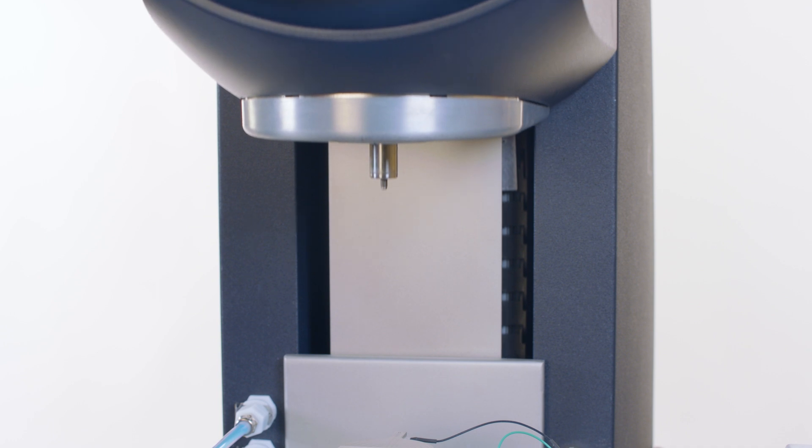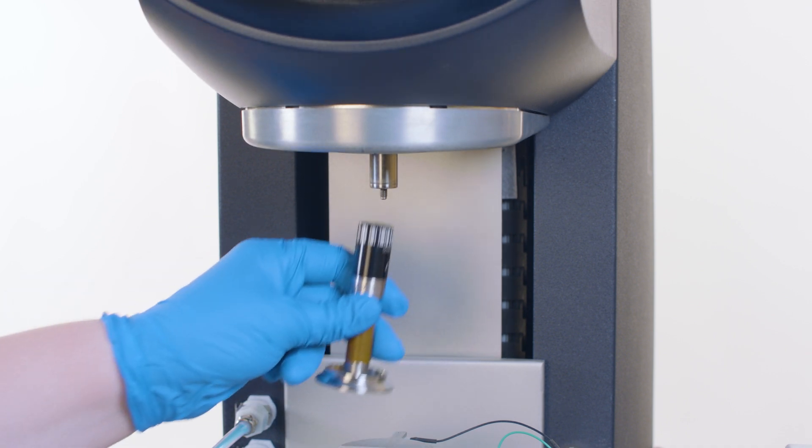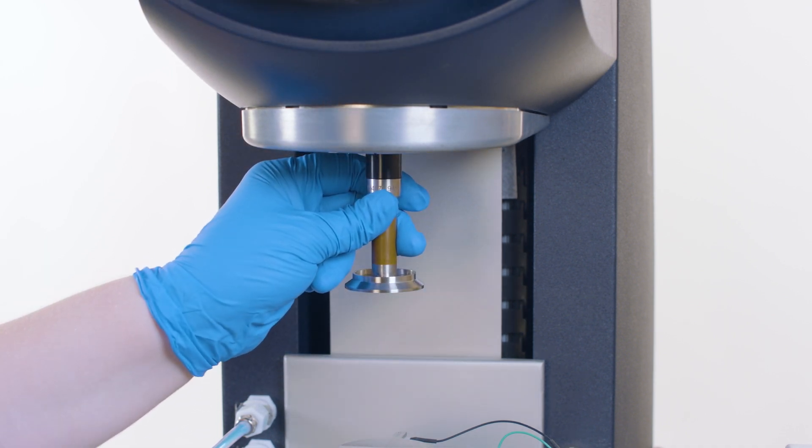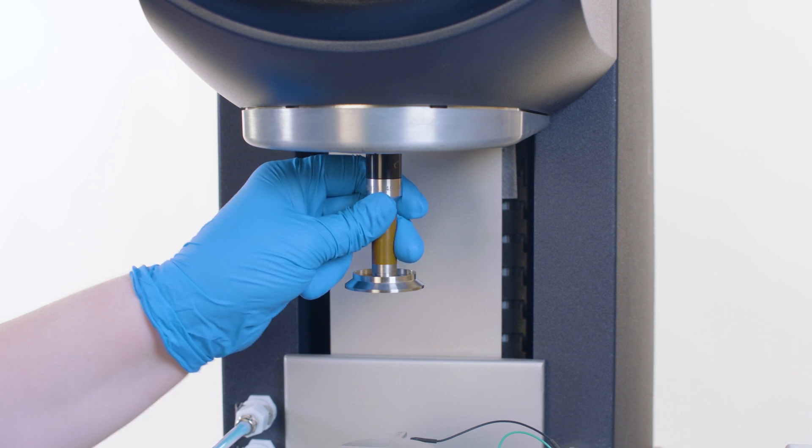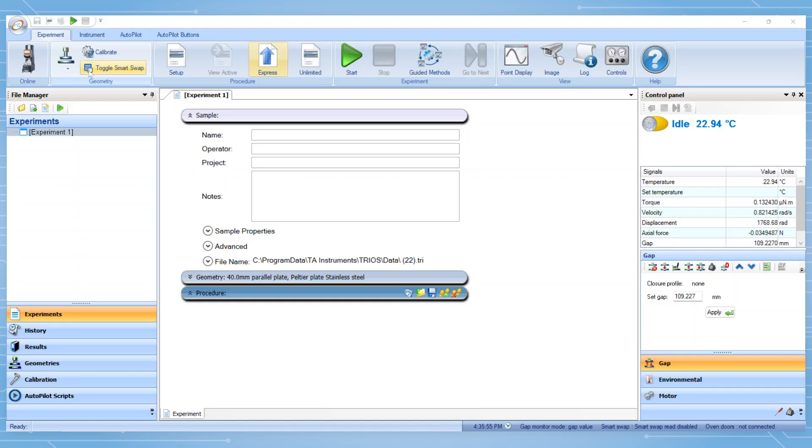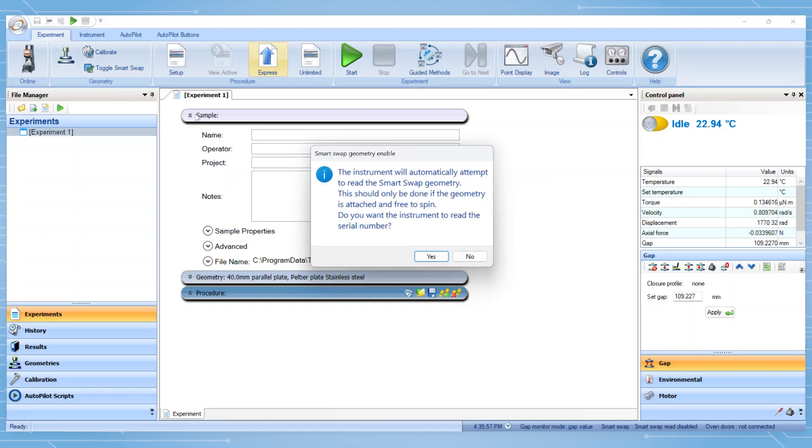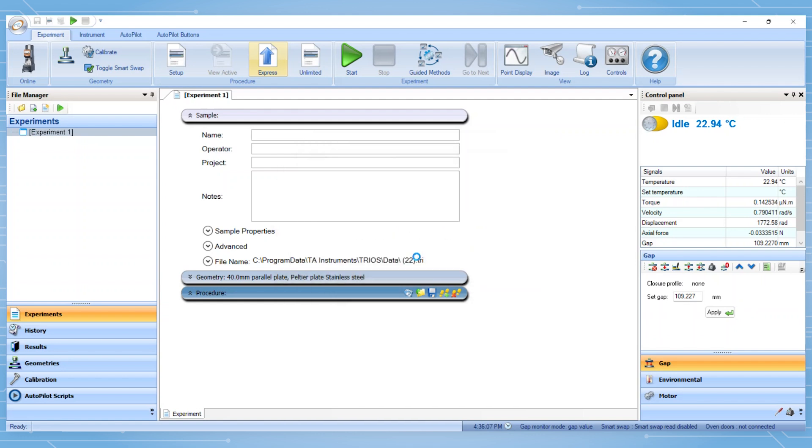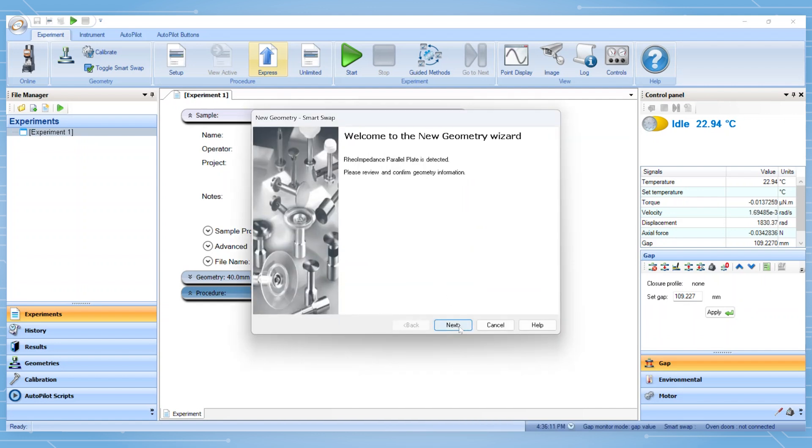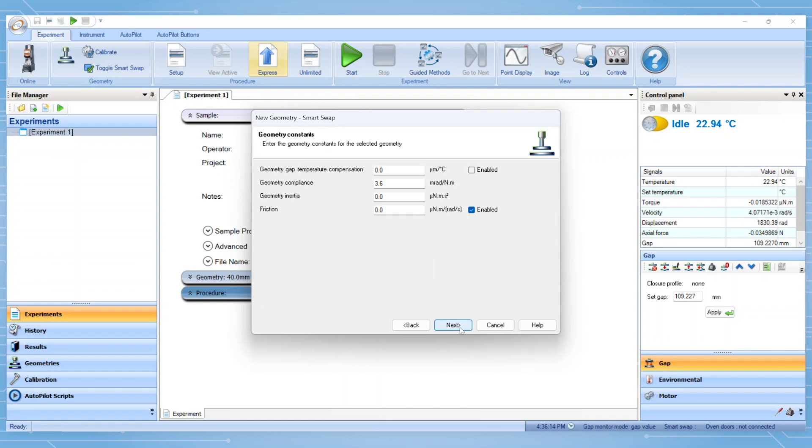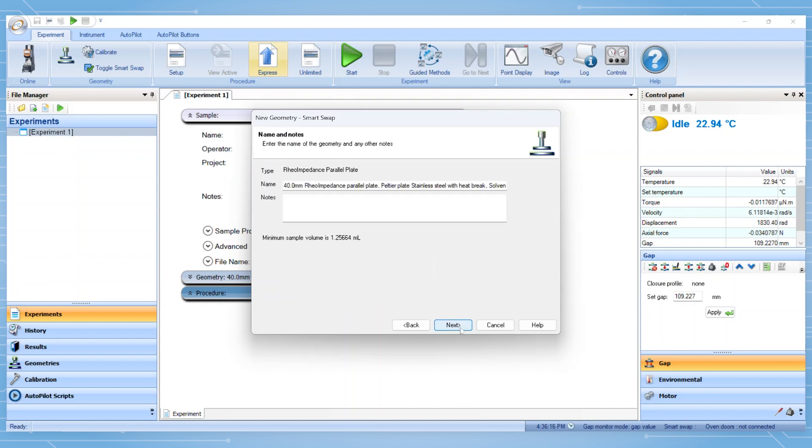Next, the head may be lowered to install the upper RAIOIS geometry. Push the geometry up the spindle and screw the draw rod finger tight. With smart swap enabled, the instrument will read the barcode on the geometry and prompt the new geometry wizard. Click Next, and finally click Finish.